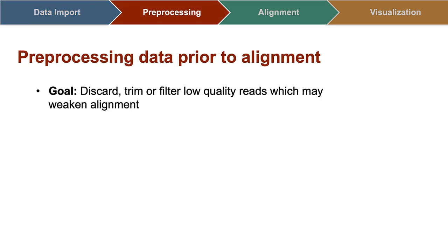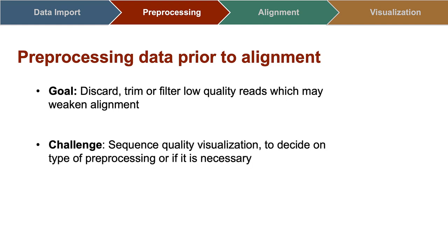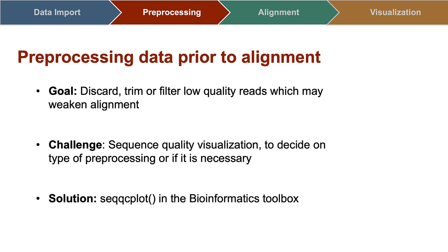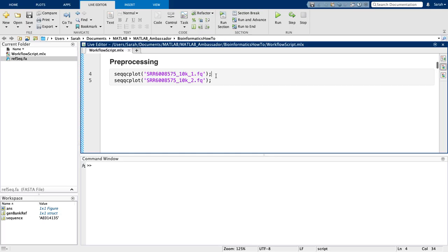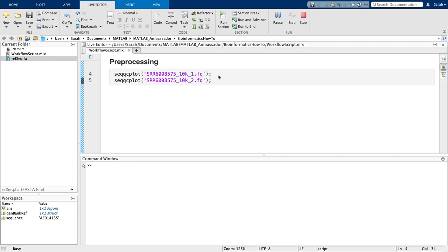Sometimes it is desirable to pre-process, such as filter or trim, sequencing samples before alignment. This can remove low-quality reads that may otherwise confound the alignment results. To visualize sample quality, SeqQCplot can be used to graphically display read quality and composition as a function of base pair.